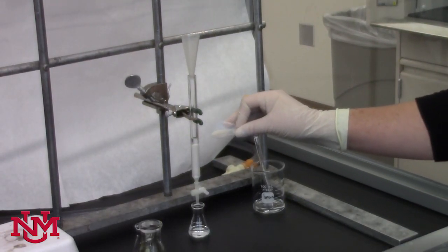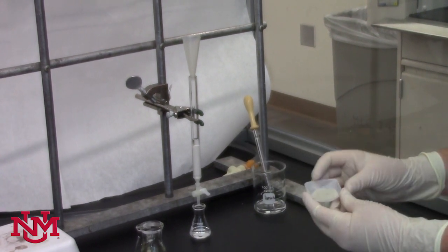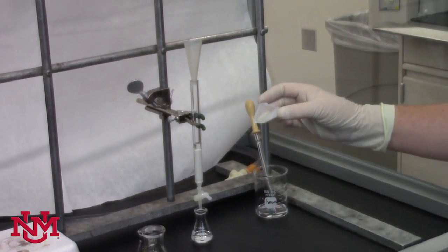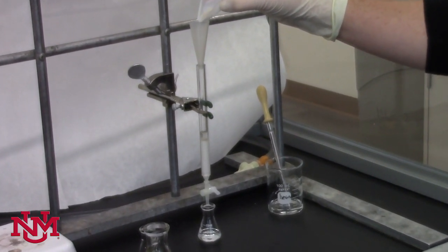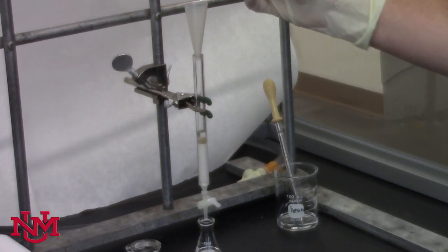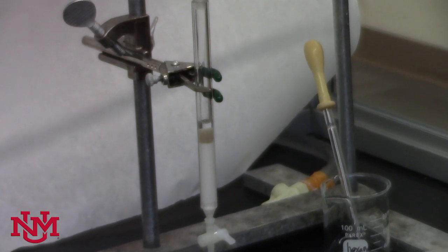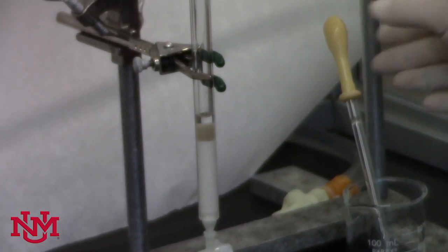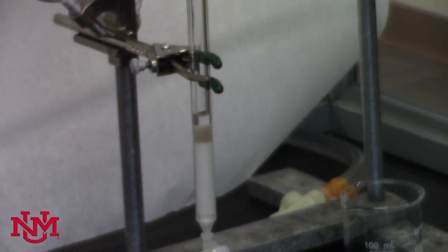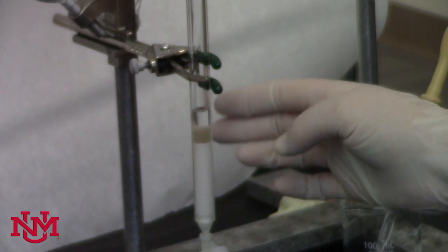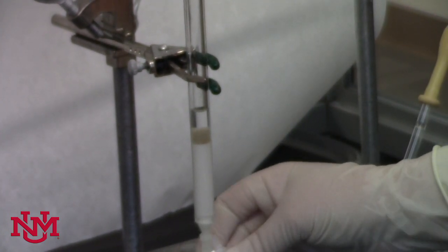Once you have about one centimeter of hexane above the layer of alumina, you'll need some sand, which you can find in the fume hood with all your other reagents. You'll need to take about a centimeter or so of that and add it through the column funnel on top of the layer of alumina. We do that to protect the alumina from anything we're going to add after we put the sand on there. You can use a little bit more hexane to wash down any of the sand, tap it to make sure it's nice and even, and then open the stopcock again.